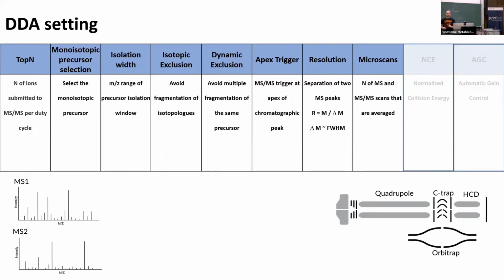Also, I know from Hannes Link's lab, with whom we are sharing our mass spec lab, they have an Agilent QTOF, and that's a central setting, the number of accumulation of scans. For us on the Orbitrap, for metabolomics, we typically use 1 microscan as default.